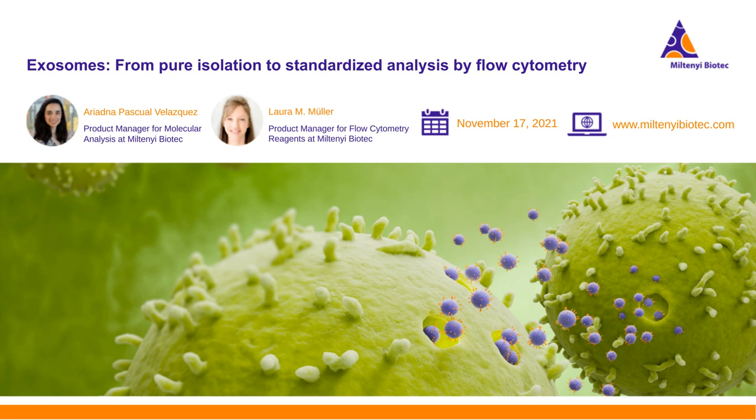That's a very good question. I think this is one of the advantages of using the beads for the analysis of the vesicles. These are large beads, about 4 micrometers in diameter, so they can easily be detected in a flow cytometer like usual cells. And we do not detect single vesicles by this assay. So if there were some contamination of vesicles in the solution, we simply would not detect them, because we just detect the signals related to the beads, and we don't see the signals from the background.